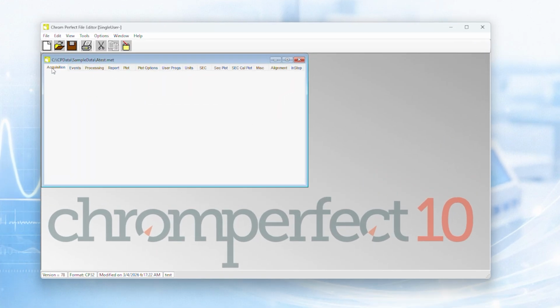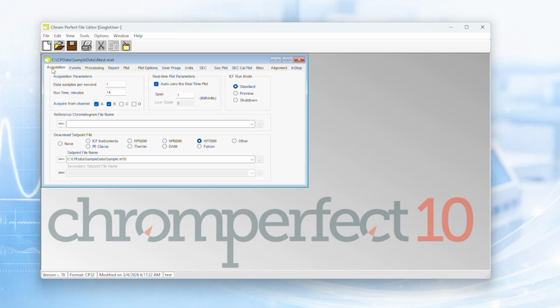We begin with the Acquisition tab. The Acquisition tab defines how raw data is physically collected from the instrument. This includes parameters such as data samples per second, runtime, and channel assignment. These settings directly determine the content of the data file that is created.